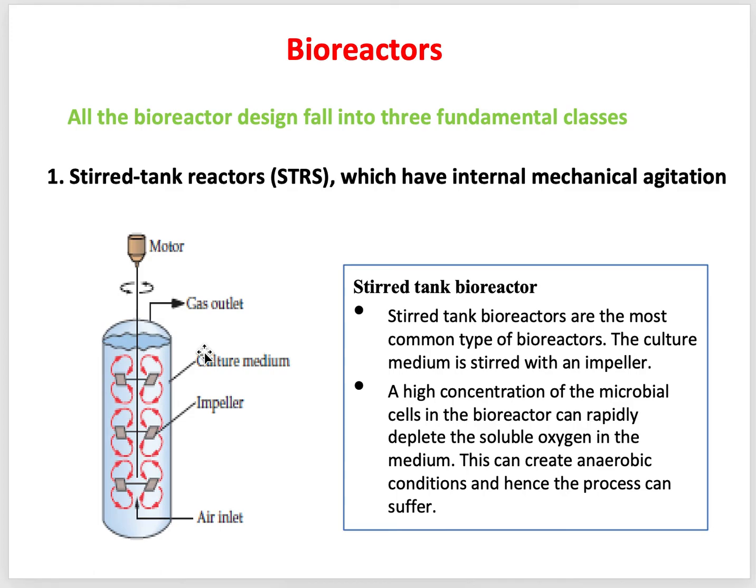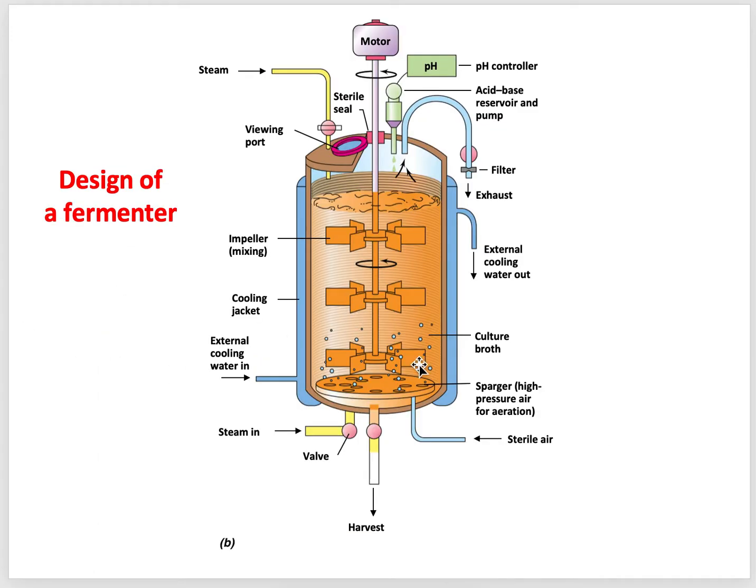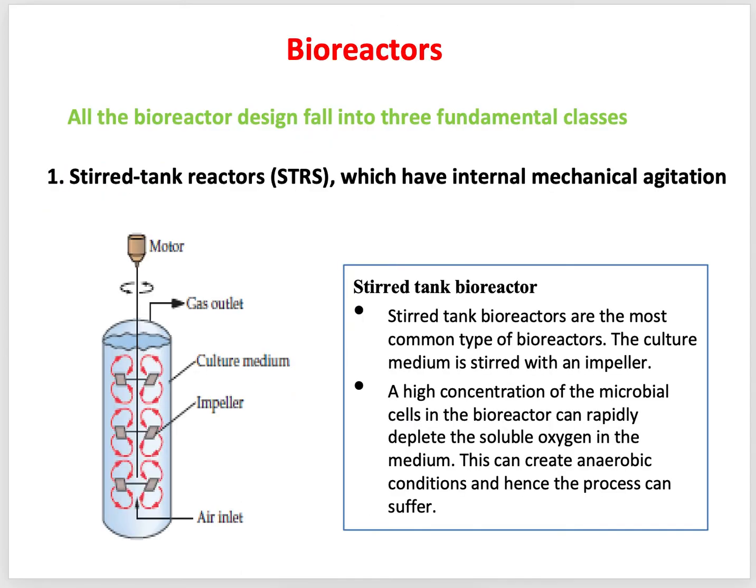To resolve that, people put an air inlet here to inject oxygen continuously by using a sparger, this device. There is an air inlet and sparger to continuously inject the required amount of oxygen, which can prevent anaerobic condition formation.